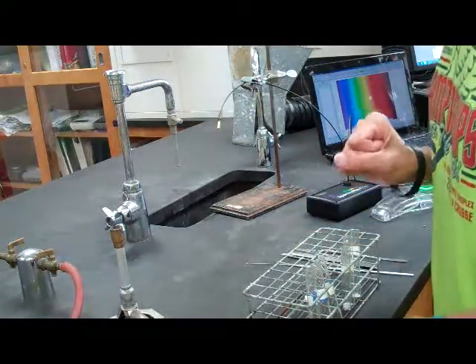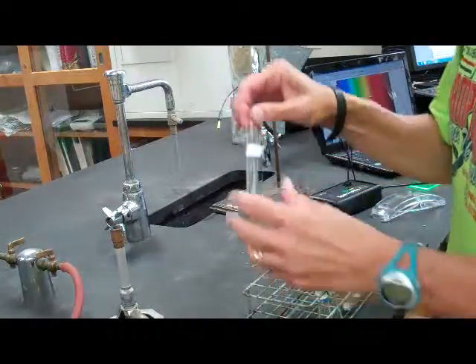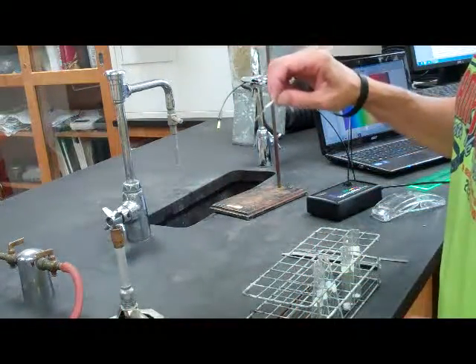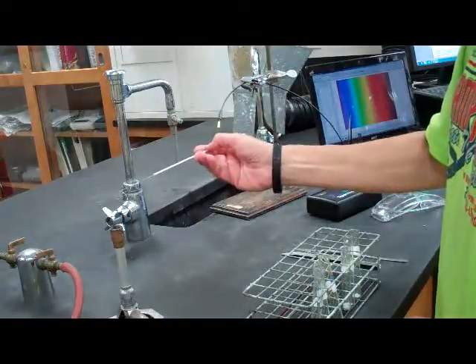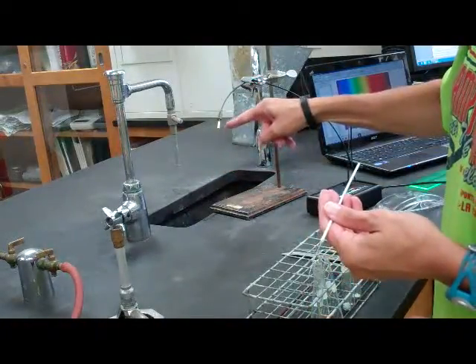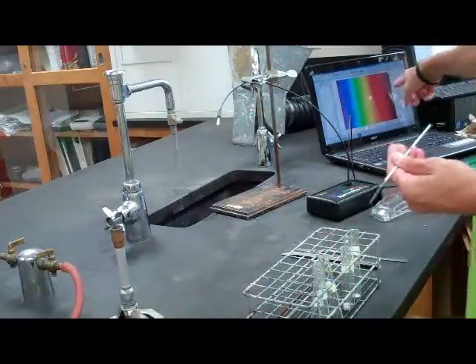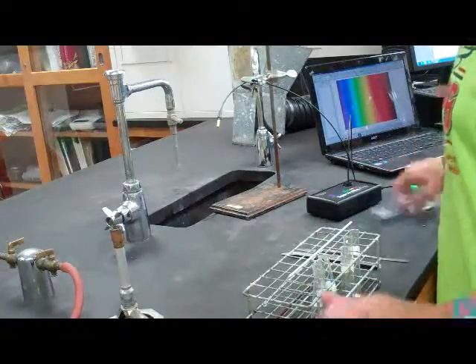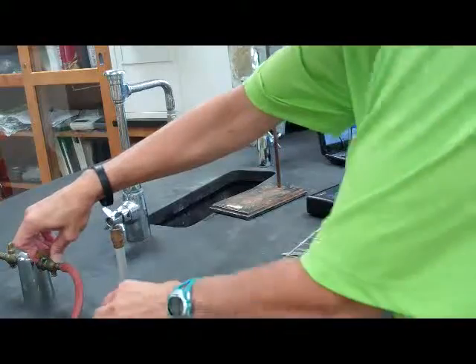And then the second part of Part B has us working with the solids. We will be using a loop, dipping the loop into the solids, then putting them into the flame, and the fiber optic cable will sense the color and give us a readout in nanometers of that spectrum. So, goggles on, lighting our Bunsen burner.